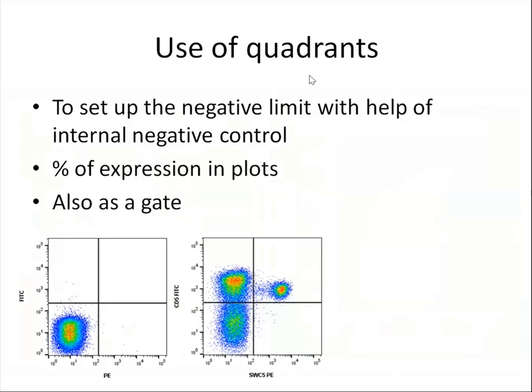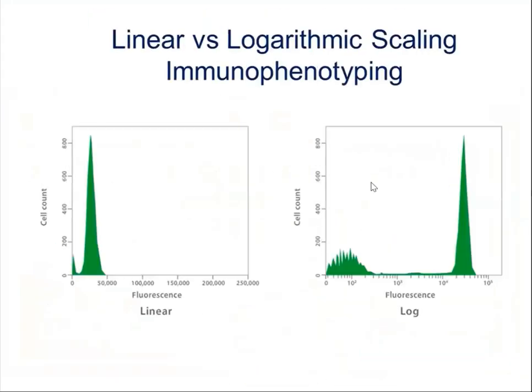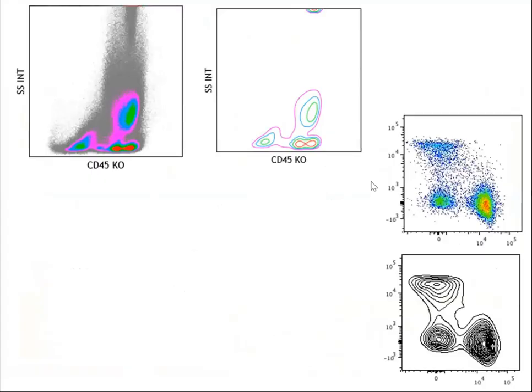So I'll go back. That's a good doubt. Now, see, this is a density plot. Different colors do not determine different populations. See, this is neutrophils, this is lymphocytes, this is erythroid or RBC population. Now, every population has a pink color. Does that mean they are all different?